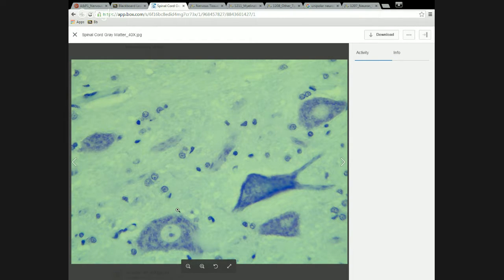Now, I use the example that this might be a cell that controls flexing my fingers, because the cross-section of the spinal cord we're looking at is from the cervical region, the neck region, which we control with the arms. But imagine if we were looking at a cross-section towards the bottom of the spinal cord, which is responsible for controlling muscles in my foot.